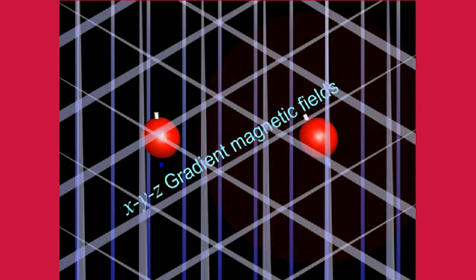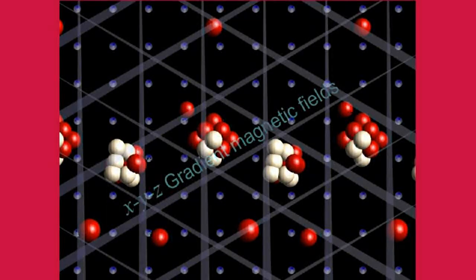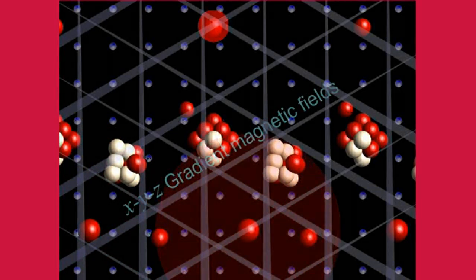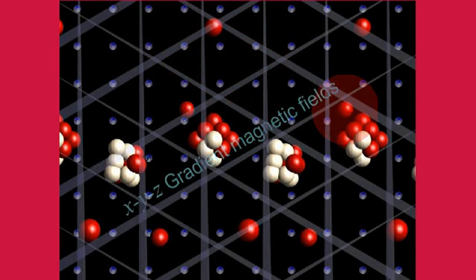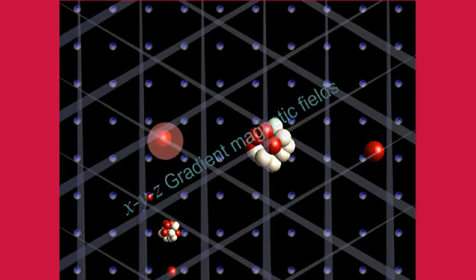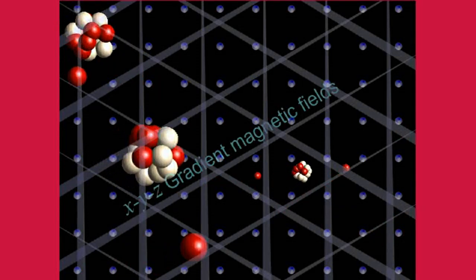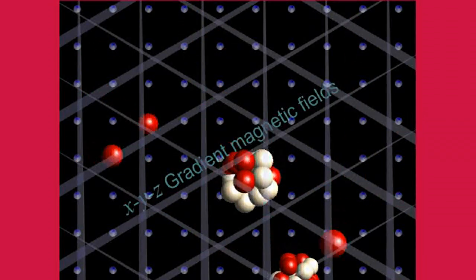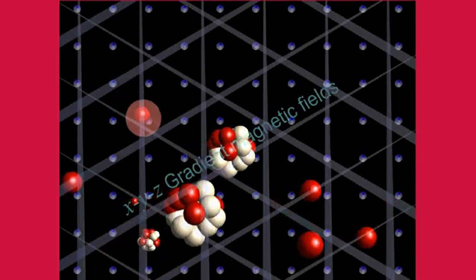The time required for this transfer is such that in a molecule such as fat, which has a large molecular shape and hydrogen atoms that are difficult to move, energy is quickly transferred to surrounding atomic molecules, and the time is shortened, resulting in a strong signal. On the contrary, in the part containing many small molecules such as water molecules, the movement of the molecules is intense. So the transfer of energy from one molecule to another does not work well, and the time until the energy returns to a low state is longer, and the signal from those parts is weaker.